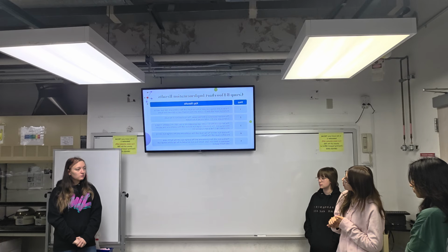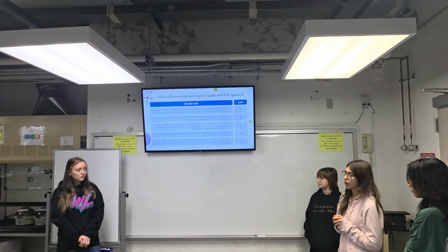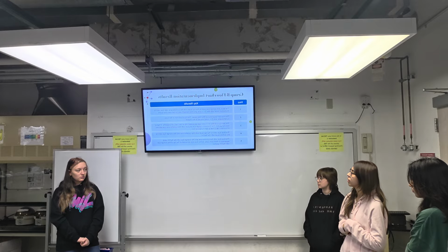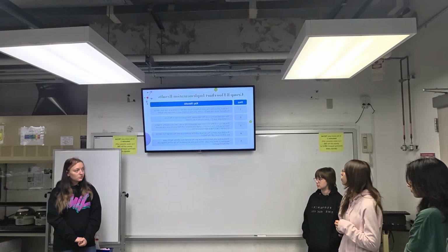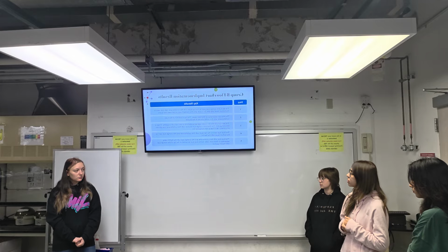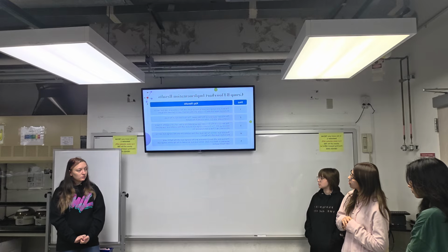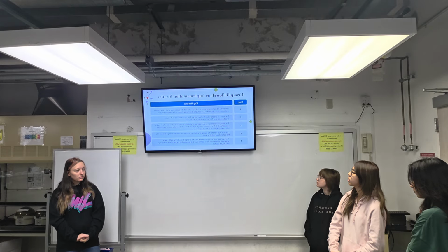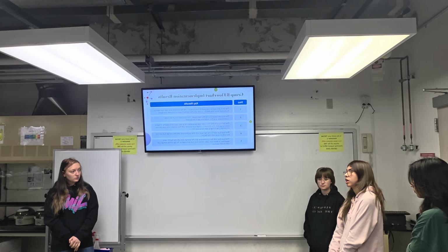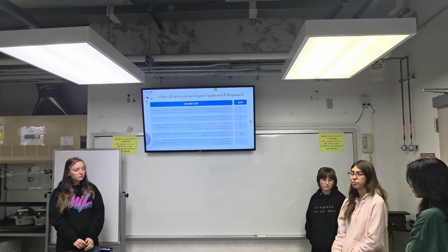The third step, the red dye went with the DI water, and separated into a new vial with a pipette. It had a red-orange tint. The blue and orange dye solution with the cyclohexane was poured into a new vial, and it had a dark turquoise tint. The fourth step, the blue dye went to the top layer with the cyclohexane, and the orange dye went to the bottom layer with the NaOH. And in the fifth step, the blue dye with the cyclohexane and the orange dye with the NaOH were separated into their own vials. And some blue dye remained on top of the orange dye with the NaOH solution because pipetting was a little bit difficult.